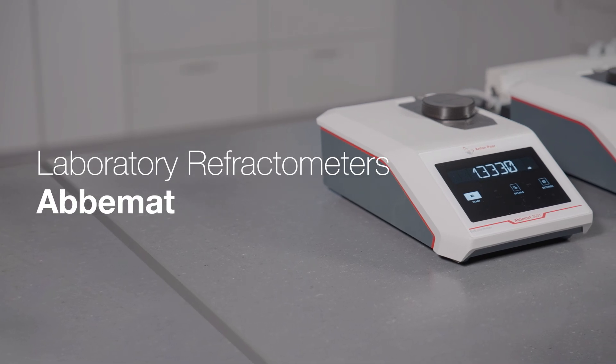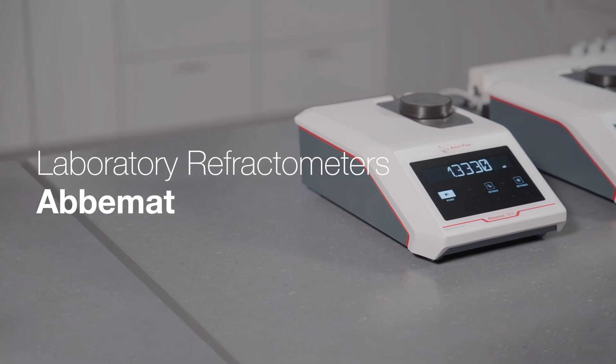In the quality assessment of your products, both accuracy and speed are crucial.